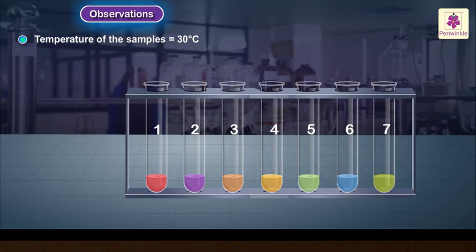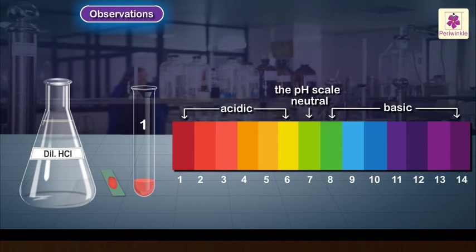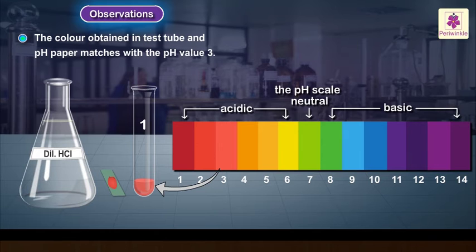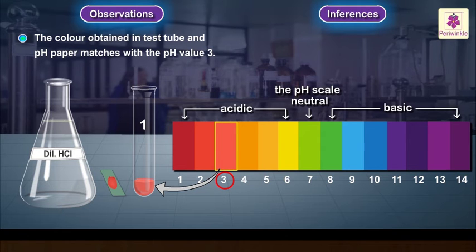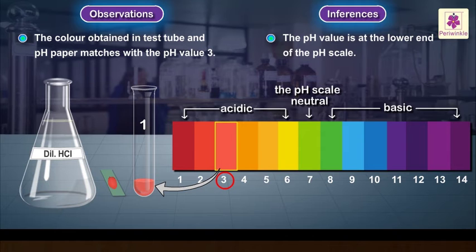Temperature of the samples is equal to 30 degrees Celsius. Dilute hydrochloric acid solution: the color obtained in the test tube and pH paper matches with pH value 3. Inference: the pH value is at the lower end of the pH scale.